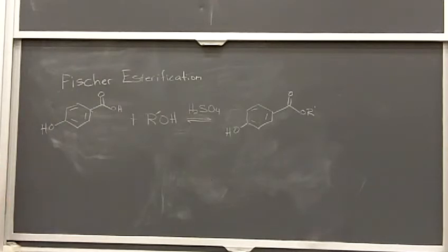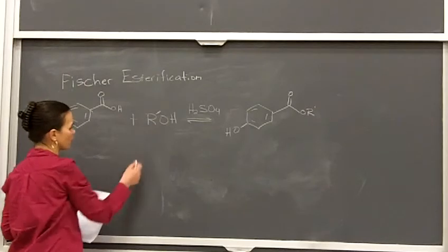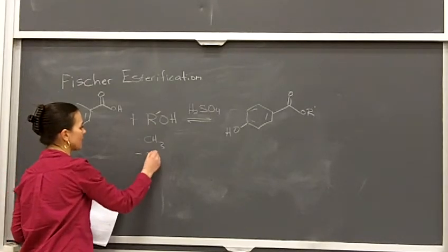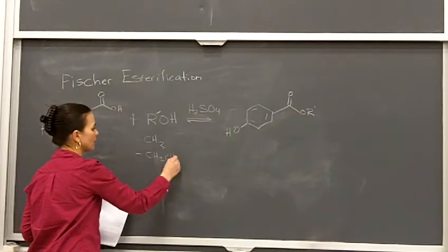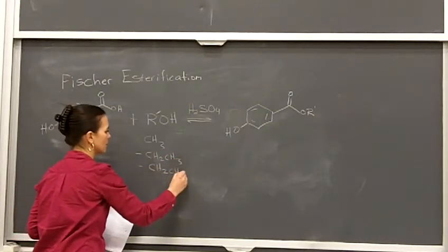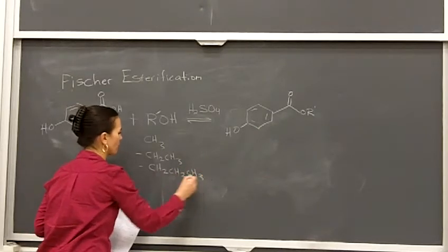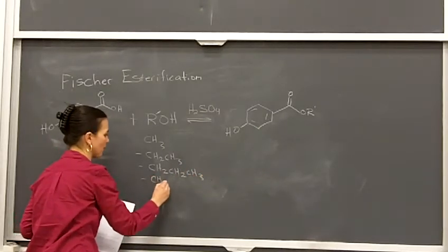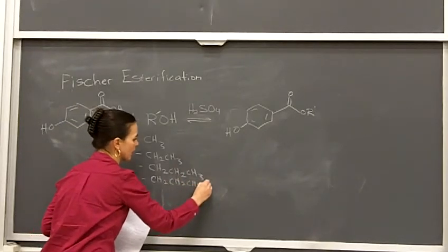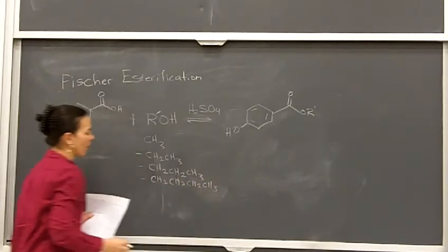Now the other thing with this reaction is there's only certain alcohols that really work. So the possibilities that we gave you are the really good ones. We could also throw butyl in there, but what we want are straight chain alcohols, okay?